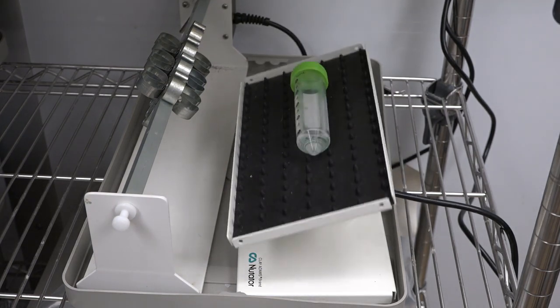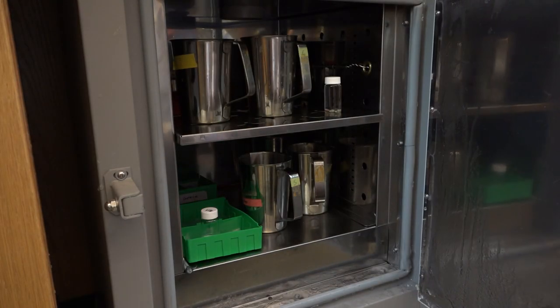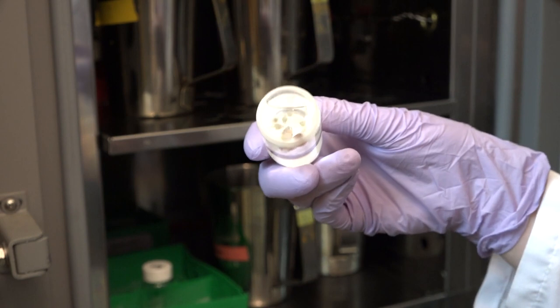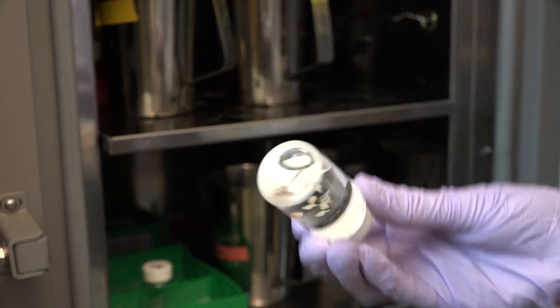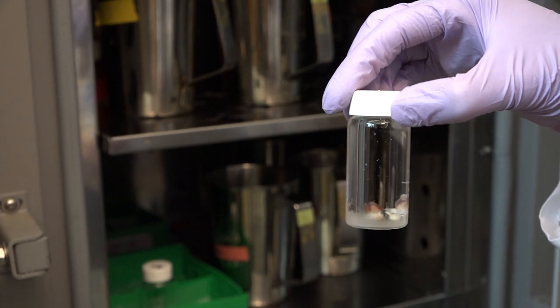Following chemical fixation, the next step is to embed the tissue. Today we'll be using paraffin wax, but you can also embed tissue in resin or gel, depending on what you're trying to look at. Here are the flower buds in melted wax. It took multiple days and many different chemical washes to gently and gradually transition them from the FAA to the wax, but we made it.